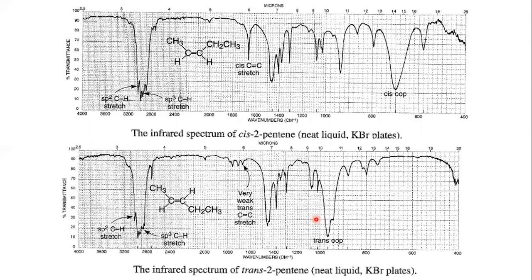Most of my young students ask the question: sir, you people are using this cis and trans. How can one recognize that this is cis and that is trans? If I just rotate this, it is a 3D image in the air, and anyone can name it. So how can you see that? And then they crack jokes that chemistry is not real. Basically, we don't have the understanding and don't reach the level where we can easily interpret the spectra. Now you have that level and you can easily interpret the spectra.